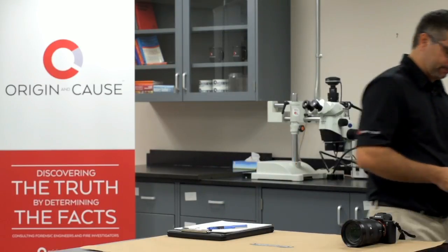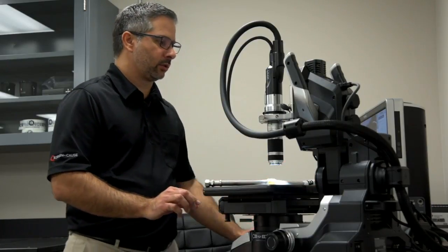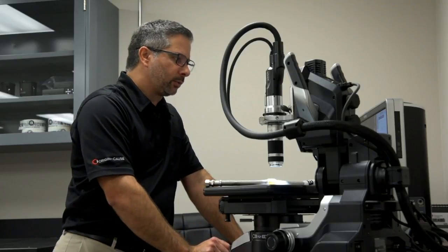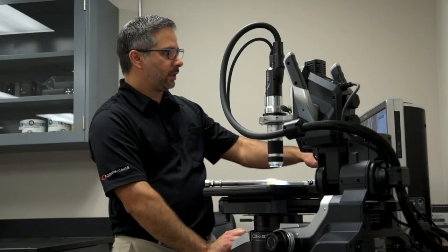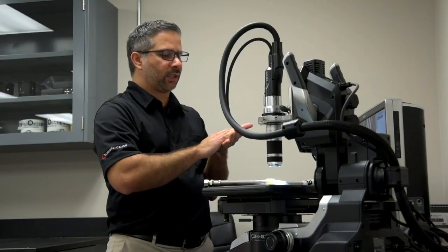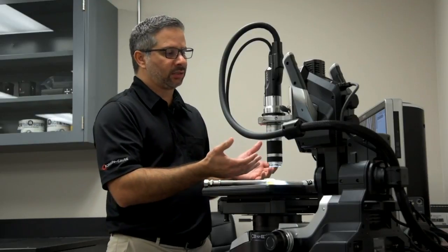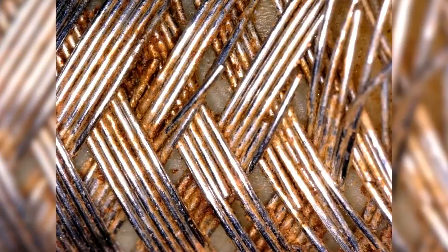So we're now here at the microscope, and we want to look at the corrosion issue in more detail. Basically, with the microscope, we can get some very good close-ups, and as you can see here, we can find out how those braided wires failed. We can see the braids sheared perpendicular to the axis, and what that means in this type of material is, in most cases, stress corrosion cracking.